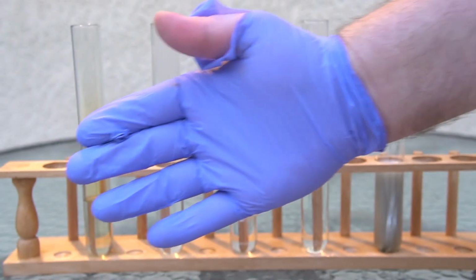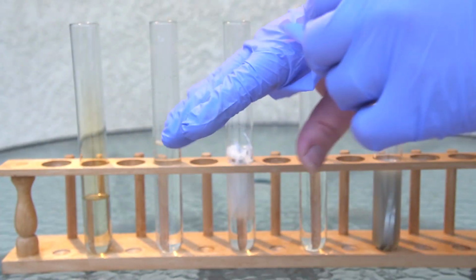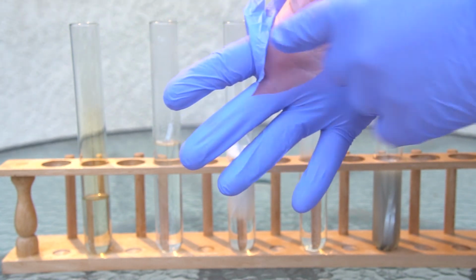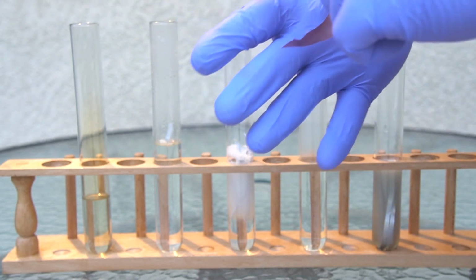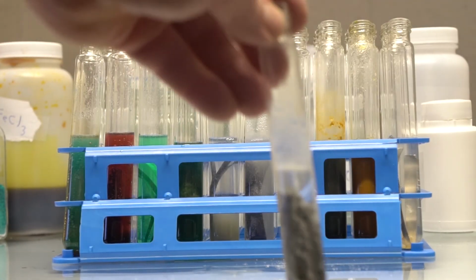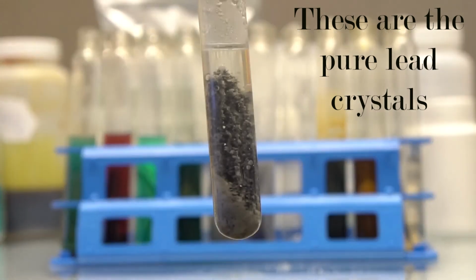I only had nitrile gloves, which are a good choice with everything we use today except for the nitric acid. Even though the gloves did not come in contact with the nitric acid, the fumes weakened one glove enough so it basically fell apart. However, as you can see, the other glove was still fine. Overall, we were very pleased with how magnesium reacted today and how it surprised us with several of the reactions.